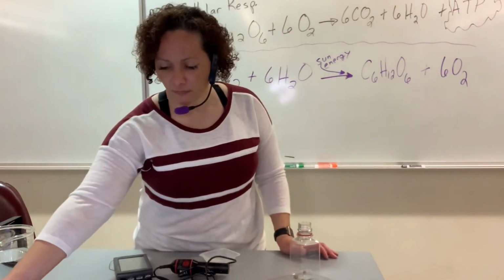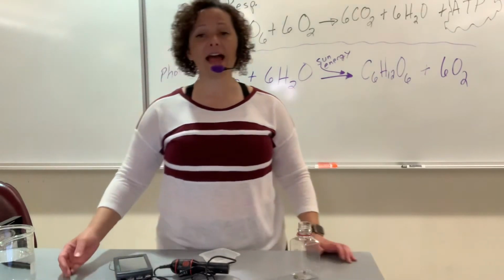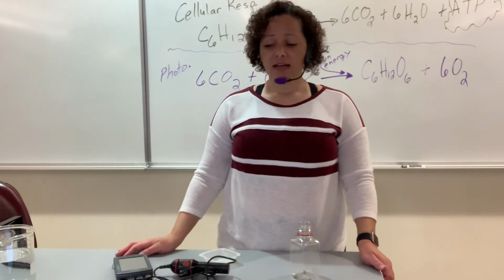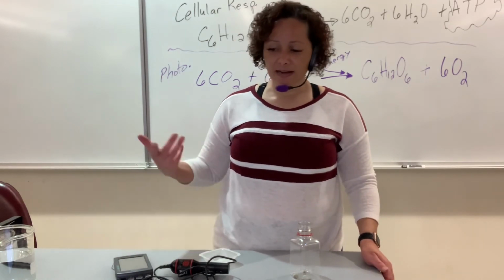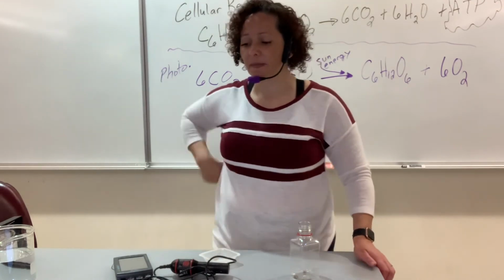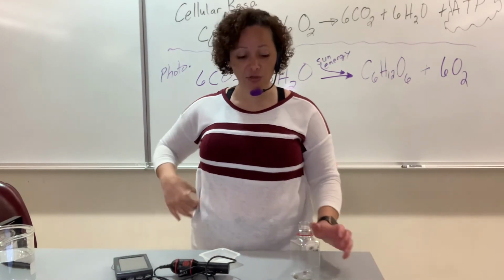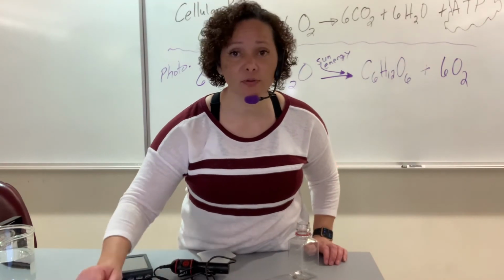Alrighty, so once you have done that and you've collected your data, you then need to figure out the average respiration rate. So I'm now looking at your table number 3. Table number 3 will be the average respiration rate for your organisms. And so as you can see, the organisms: animal in the light, animal in the dark, plant in the light, plant in the dark, seeds in the light, seeds in the dark. I'll let you know, depending on your lab, what we'll be using. The mass of the organisms. Remember initially I had you measure the mass of each of the organisms.